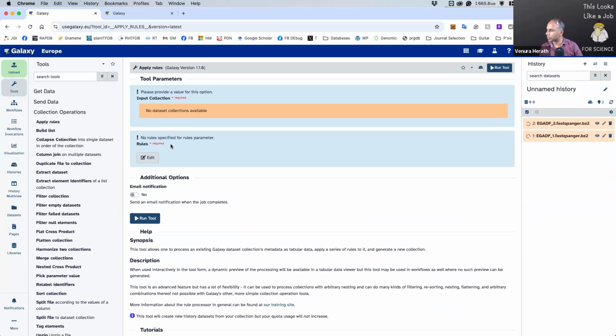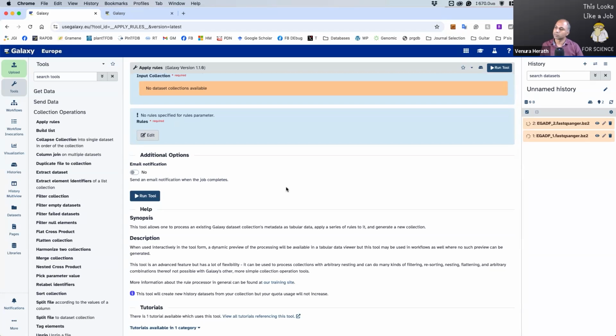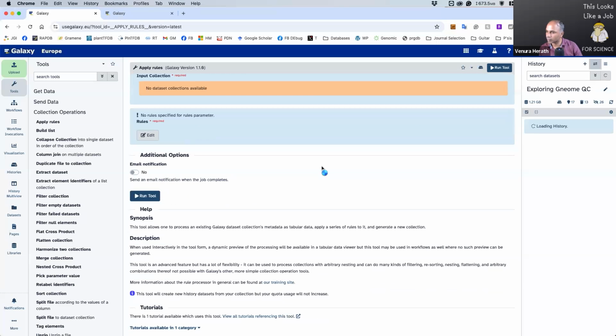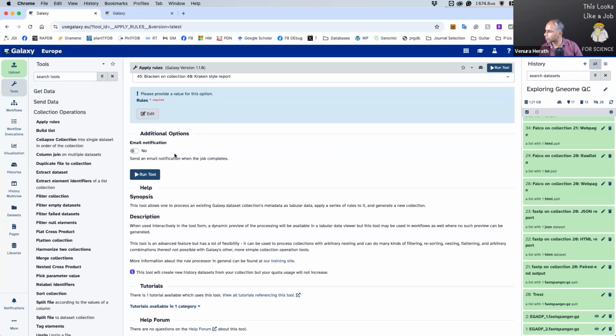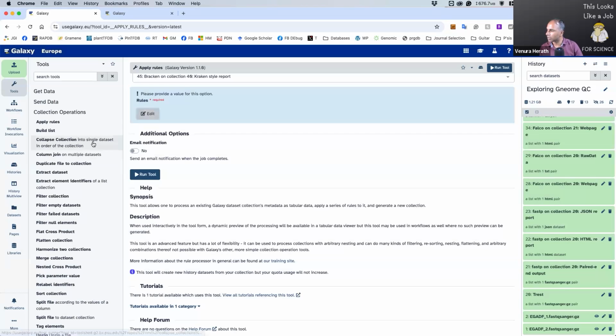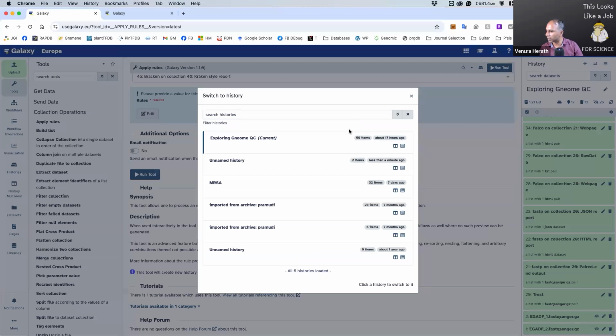Yes, so mine is uploading. Give me 1 second. Okay, I can change the environment and show you. I think I should have. Okay, because I already have a collection. So can you basically click on the apply rules, and let me go back to my latest environment.